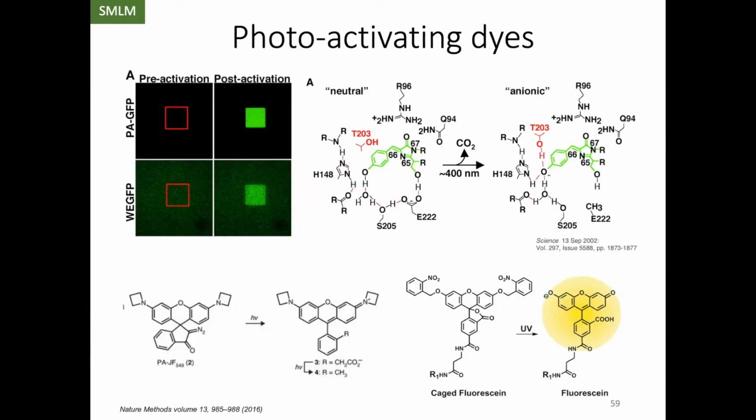So for example, here you have a photocaged fluorescein, so it's dark. When we shine light, we lose those nitrobenzene groups, and you get fluorescein, which is fluorescent. And if we shine enough light, of course, this will bleach and it will disappear. So all of these are different kinds of dyes that are activated. So in this image, you can see here, we're going to shine some UV light that triggers fluorescence, and then that results in bleaching and blinking.